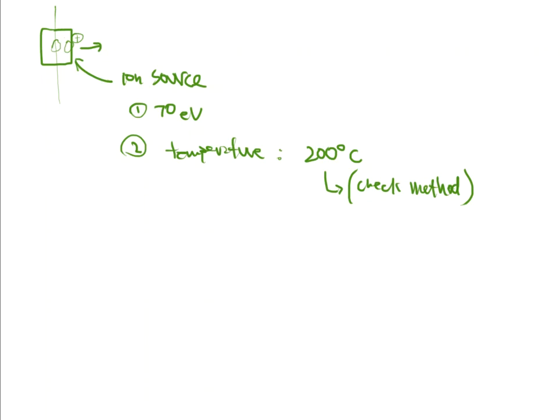All right, now we've created this positive charge. And this positively charged species has to be controlled. We can't just pump positive things through and forget about them and hope that they reach the other end at the detector, right? We need more control here. That's the problem. We've created these things. Now, how do we make sure that we keep them in line?